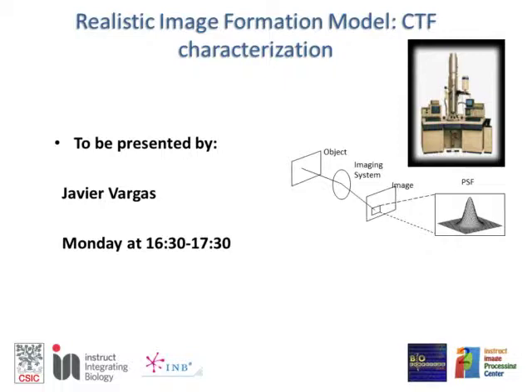The point spread function is normally worked in the electron microscopy field in Fourier space. This is absolutely crucial to go to high resolution. Because of that, it will be treated today as a separate talk by Javier. So I'm just introducing this so that we understand what we are doing. First principle: our images are like radiographies of my broken arm, projections of my 3D structure. One point is a point. This is first order. Second order, forget it: an infinitesimally small point becomes a big point.